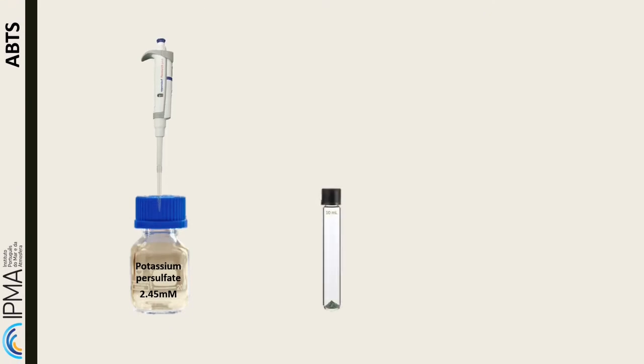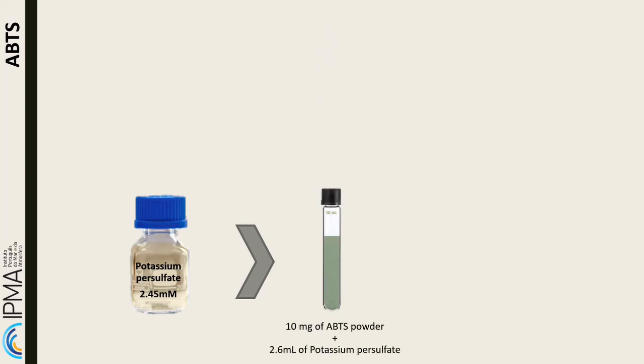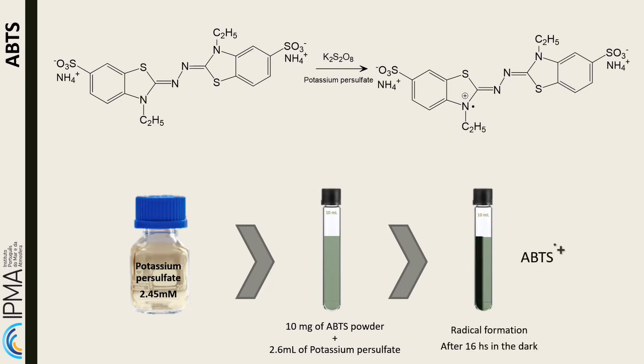The first step in the procedure is the formation of the ABTS radical. For radical formation, add 2.6 milliliters of potassium persulfate solution to 10 milligrams of ABTS. Store the tube in the dark and let it repose overnight. After at least 16 hours, the radical will be formed and the solution will be darkened.